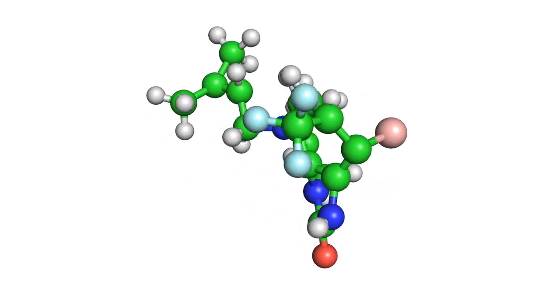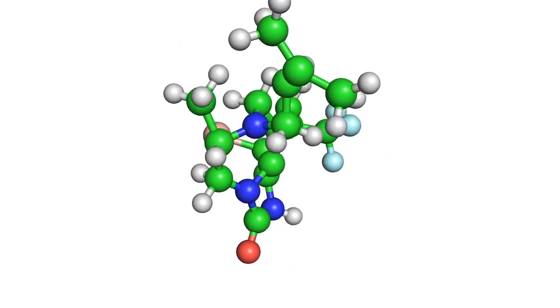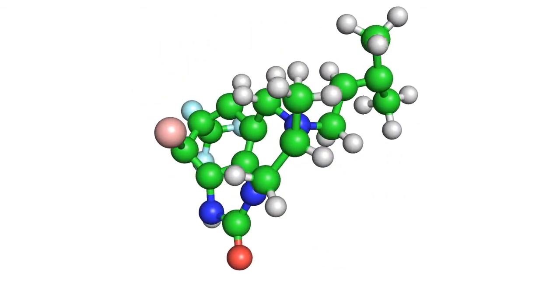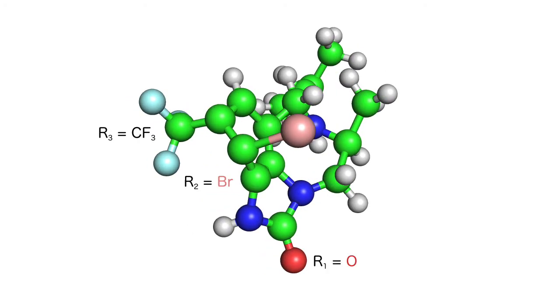And this one has an oxygen for R1 and bromine for R2. That's it for this video, you should now know how to use the basic features of Ligand Reader and Modeler.